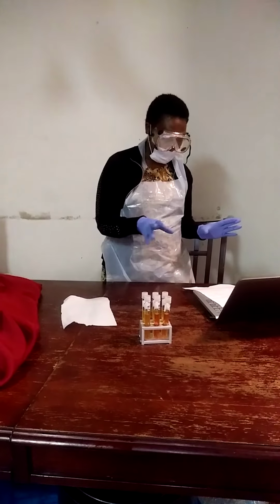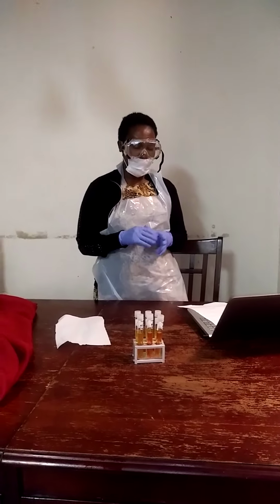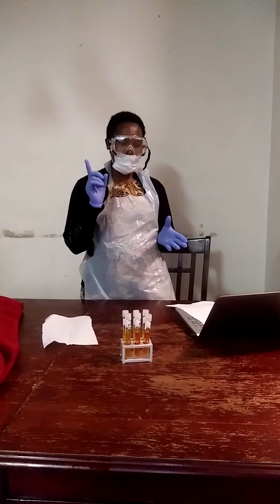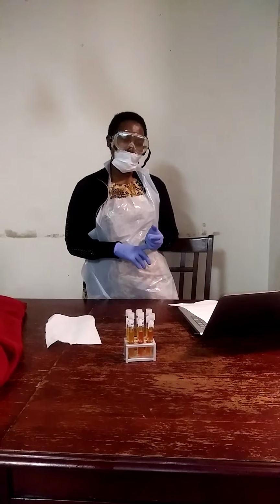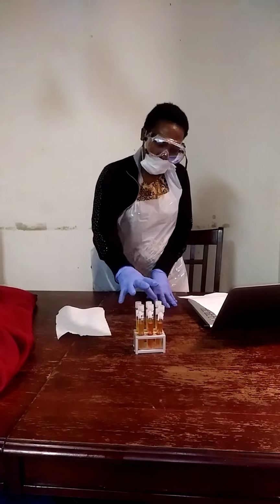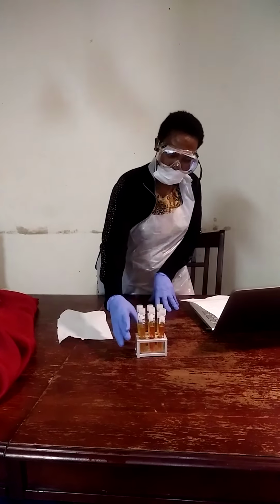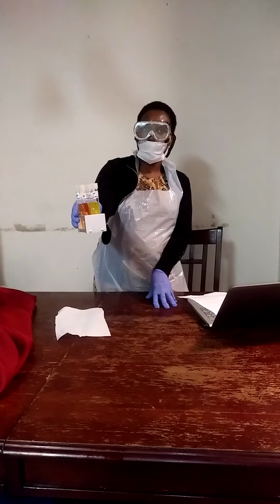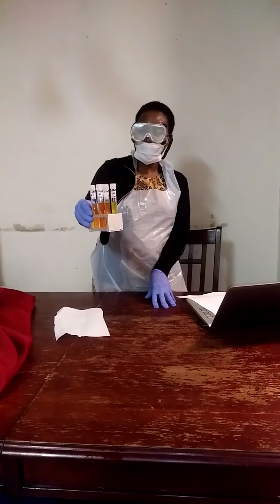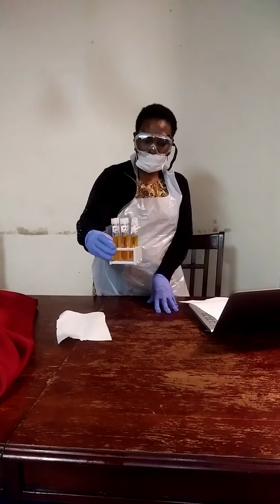After doing all this and using my active cultures, that is the yeast and Staphylococcus epidermidis, I already got my results here. And as you can see, changes have taken place, denoting what reaction happens in each one of the tubes.